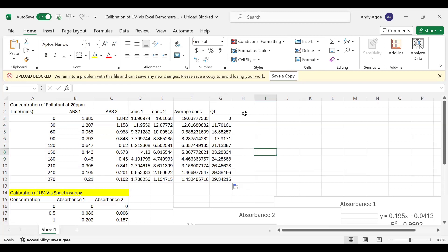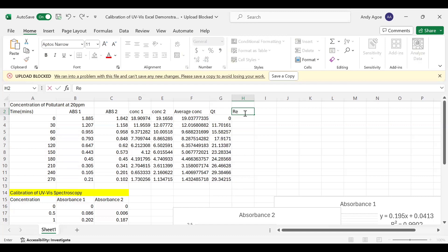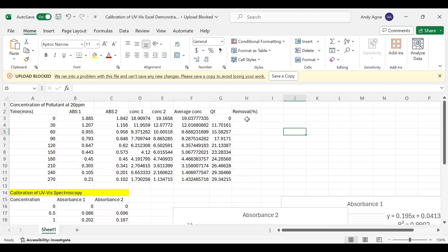What we can also do is calculate the removal rates. How much percentage was removed at maybe two hours or three hours time. We want to know the percentage of pollutants that was removed. Let's see how to get the removal percentage.